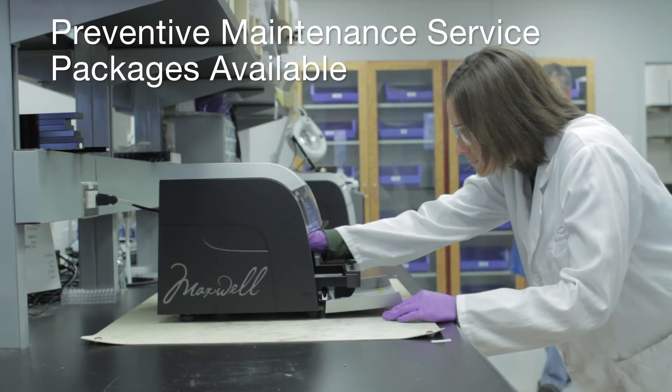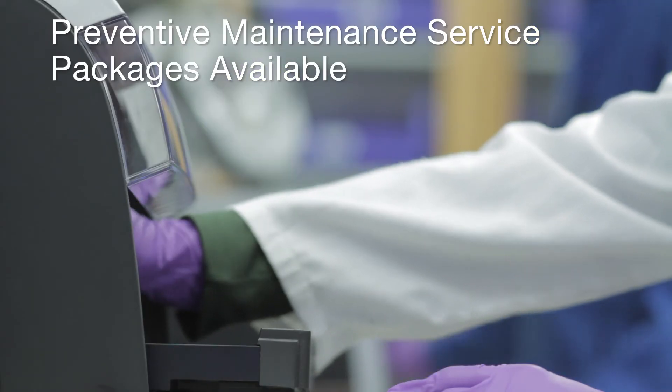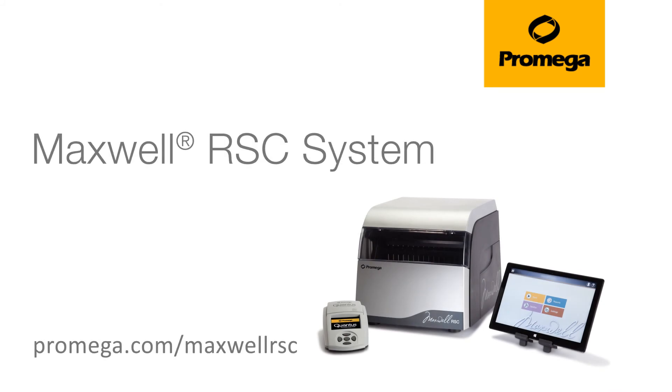The Maxwell RSC is backed by a comprehensive standard warranty, expert service, and a full line of additional service products. Be confident that your equipment will be working properly and ready when you need it. Do more with Maxwell RSC.